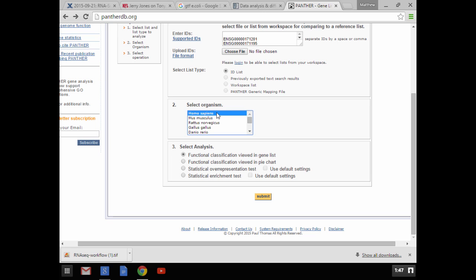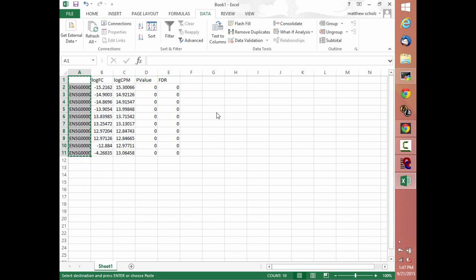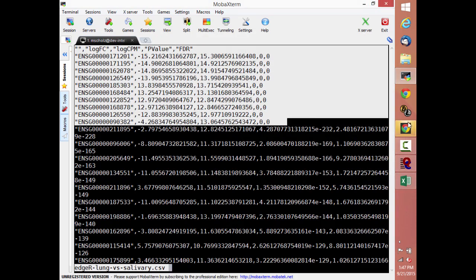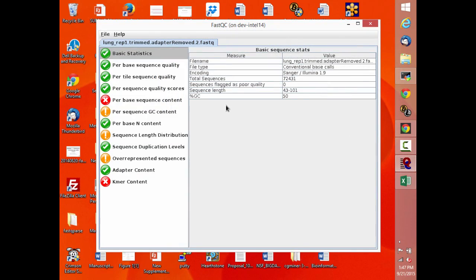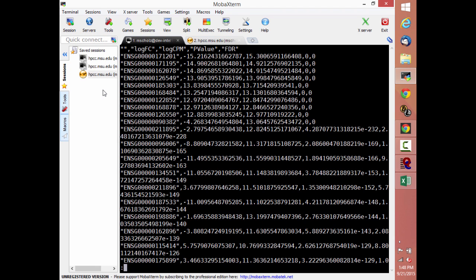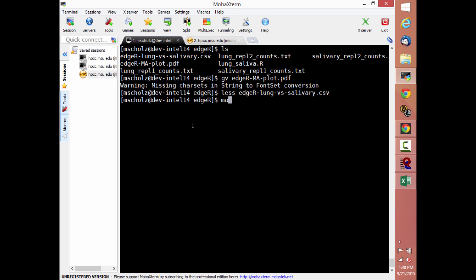But the more interesting thing in this, to me anyway, is if we are going to look at the whole sample. I'm going to do this a slightly slower way.